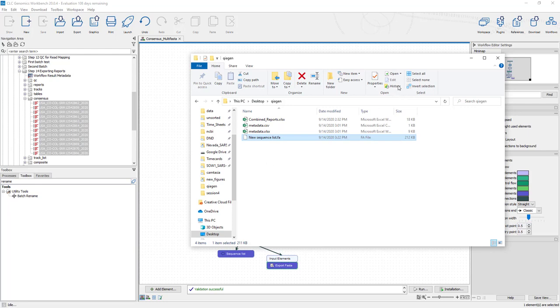Okay, I don't think I have anything else to add. So what we did with this series of videos is we saw how to import our sequences, create a workflow, get results, look at our variant calls, but then also QC our data and give a pass-fail value, use that as metadata, concatenate a FASTA file, correctly rename our specimens for the format for spheres, and then there'll probably be some additional formats that you'll have to do for GISAID versus GenBank.